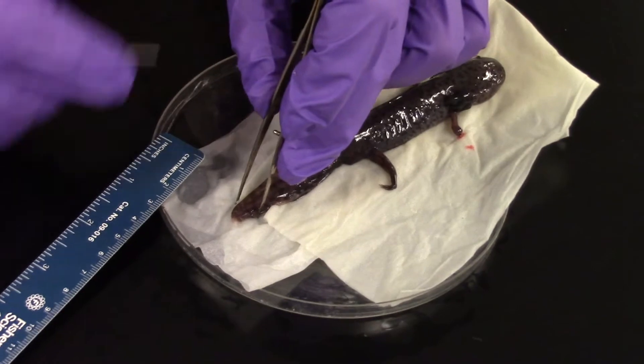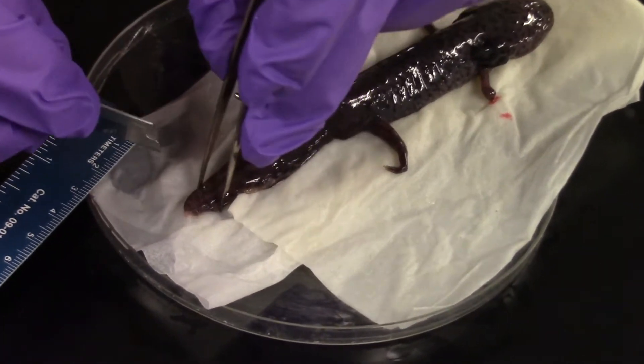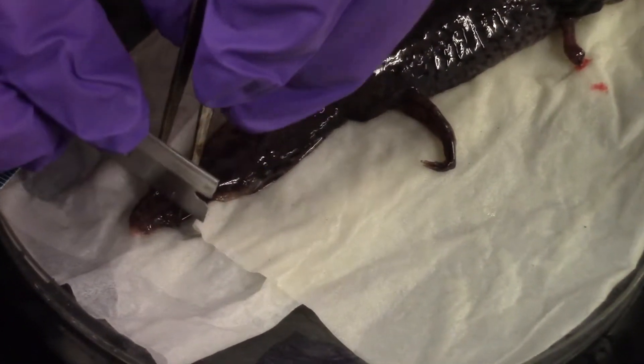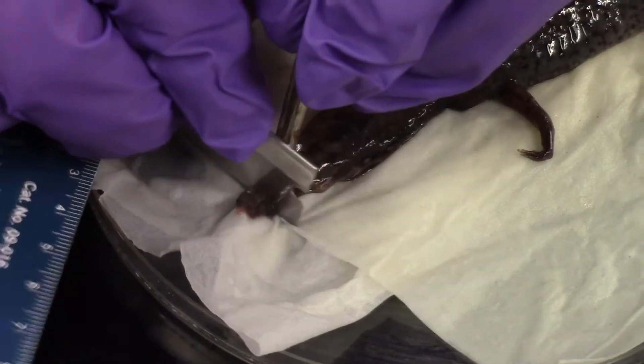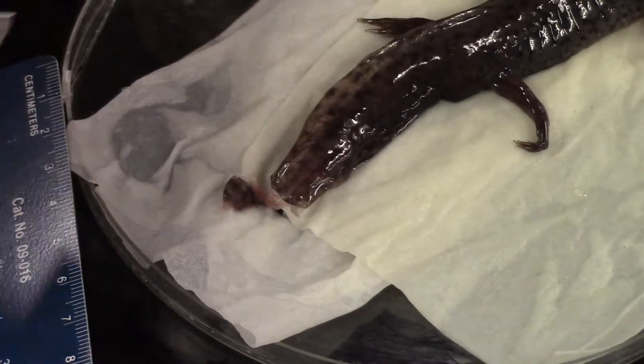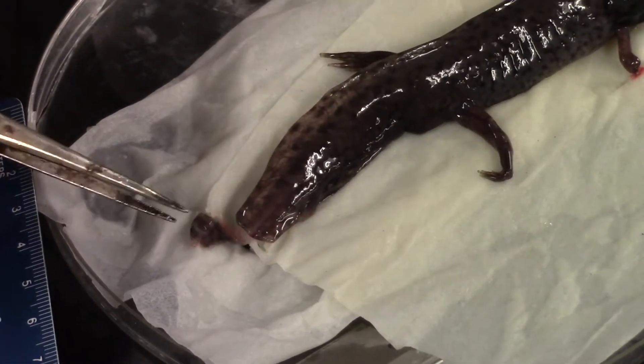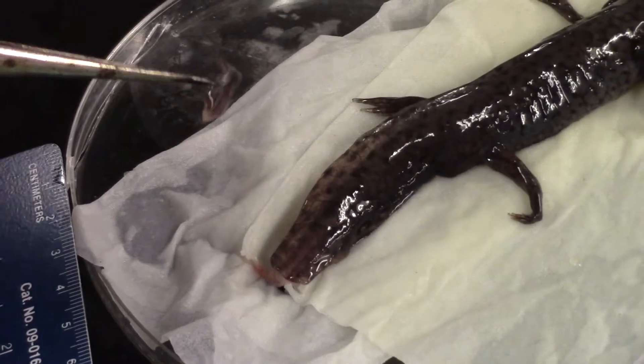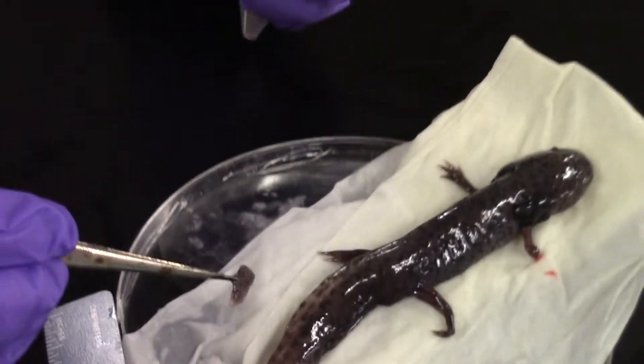So again, I'm going to hold either side with the forceps and cut right through. I'll add this piece of tail to the exact same paraformaldehyde.